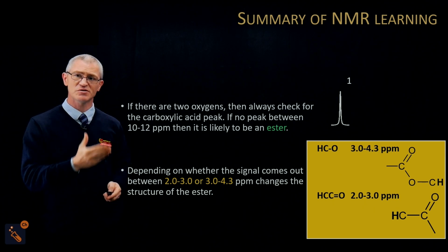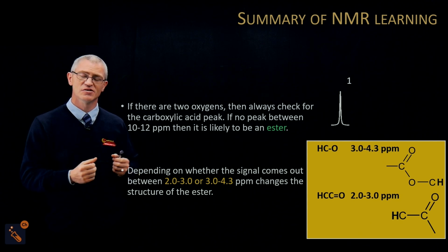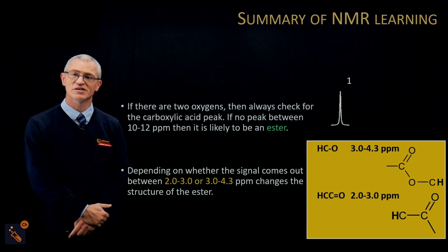Now, if you put both of those in conjunction with each other and you use the taking away of all the different sections from the molecular formula, then I'm sure you can get all the esters right in the future.